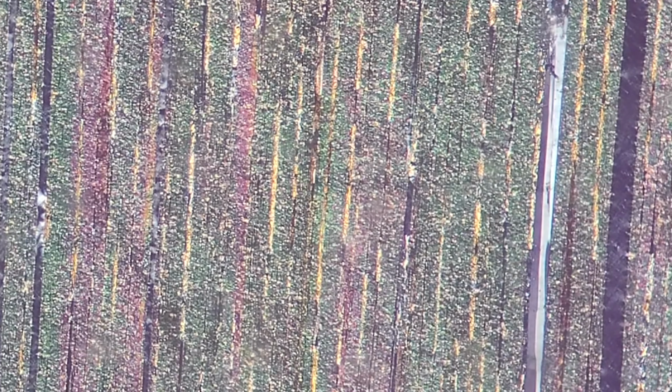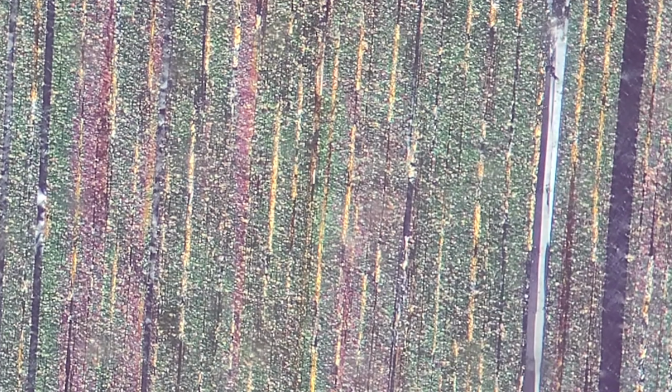Micas, such as biotite, can exhibit bird's eye extinction, where little specks of light show through the extinct mineral. This is not an inherent property of the mineral, but an artifact of the grinding during thin section creation, which causes bits of the mineral to flake off due to its platy structure. This is very helpful for telling biotite from lateral sections of hornblende.